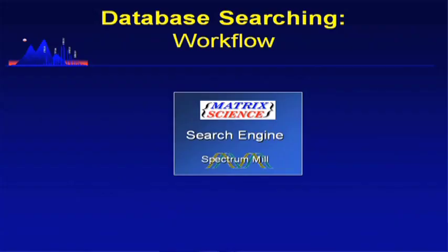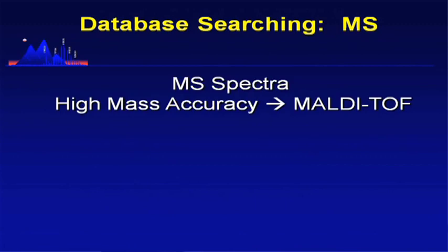All right, so we're going to talk about the search engines now. So we have these databases. They have lots of information. We're going to do some searching. So how does database searching work? There's two types of searches you can do.